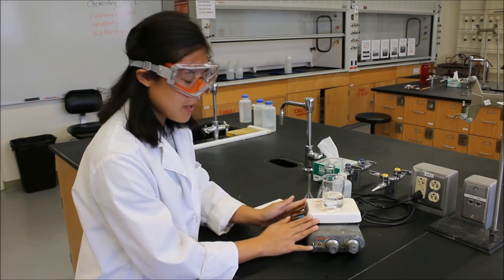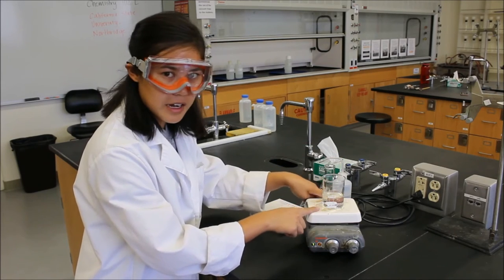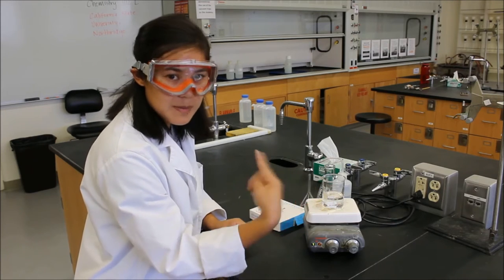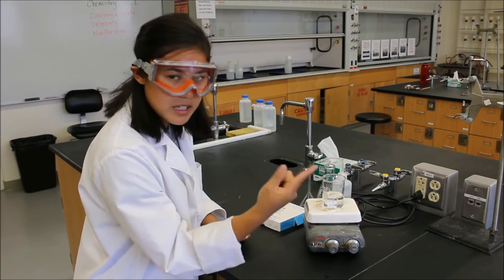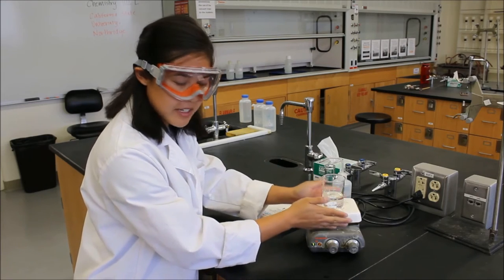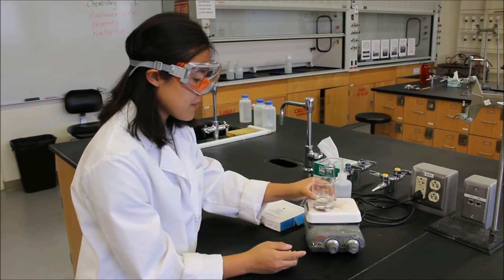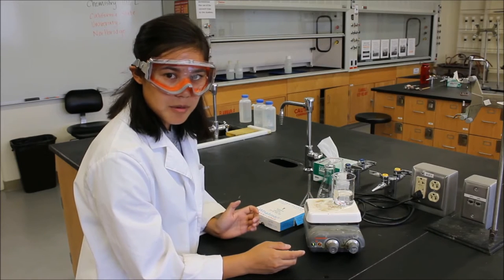Now how this stir bar works on this hot plate is that there's a little metal rod in there, it's a little magnetic, that spins when we want this to stir. So it only spins in one direction and it's in a fixed location in here. So if we have it off to the side, we won't be able to stir it properly.